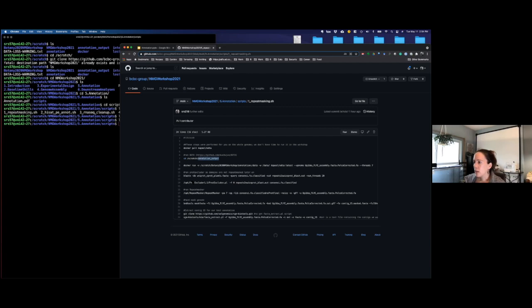So then the next thing we do is we want to see if any known proteins, so these are known proteins from UniProt again, match this file. So this file is the output from EDTA. And what sometimes will happen is, as I said, since the de novo repeat prediction is somewhat based on the frequency of certain sequences, you know, if you have transposable repeat elements, there's going to be a lot of them, right? So something that's a very high copy number could be a repeat.